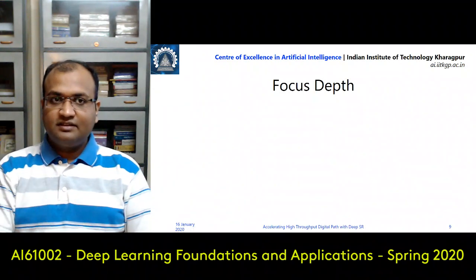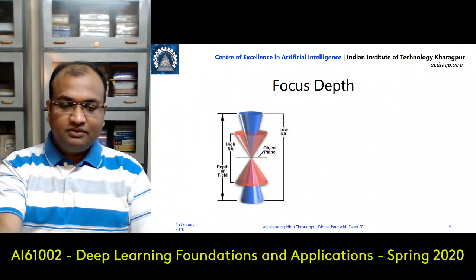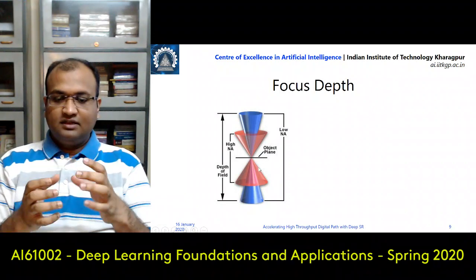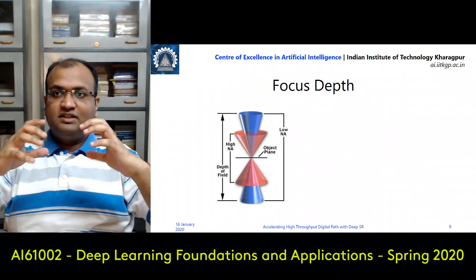The next is something of paramount importance, and this is what I was telling you about, what is called the depth of focus. So now, if you look over here, because you had this kind of an Airy disk or wavy-like pattern, everything is cumulating together.